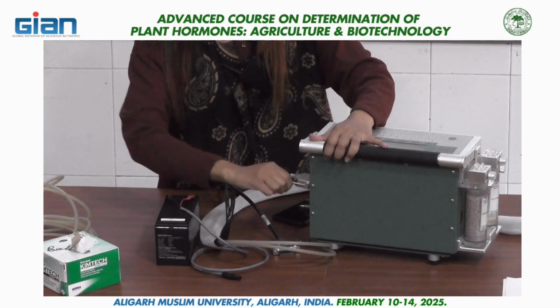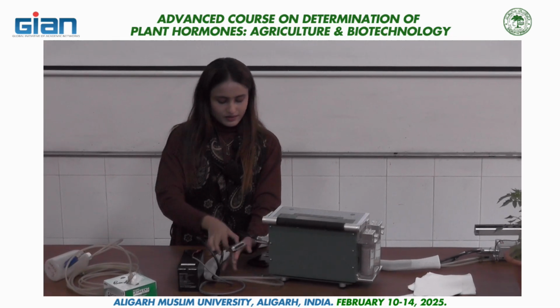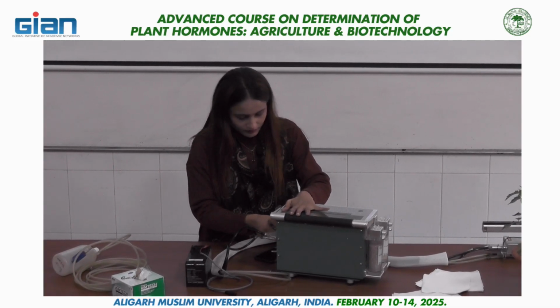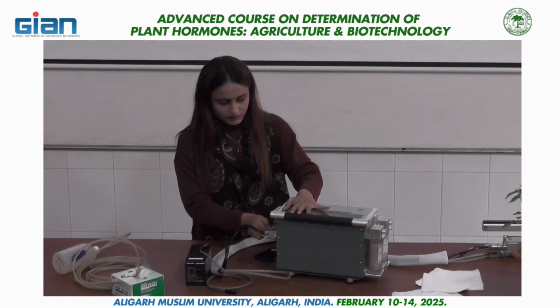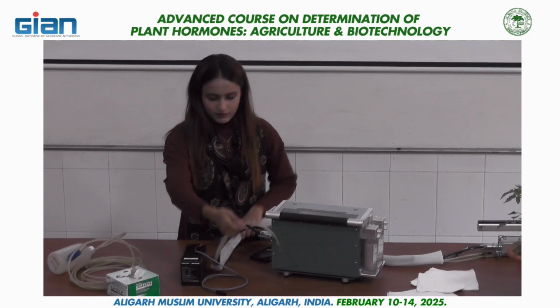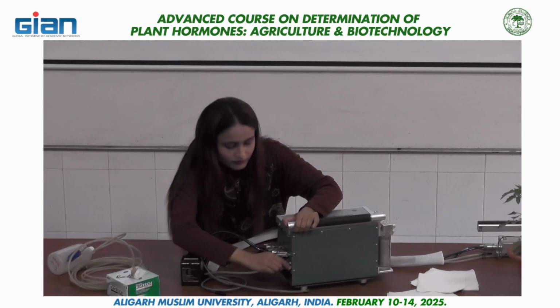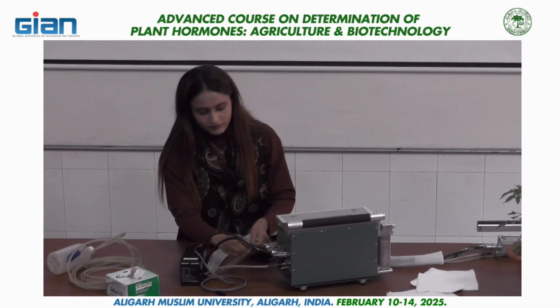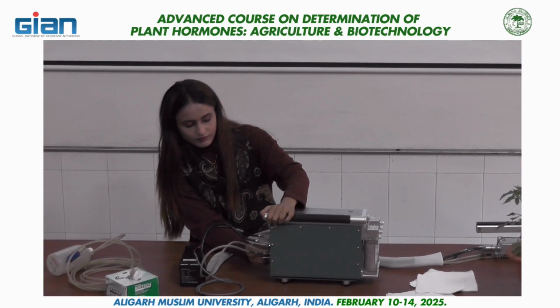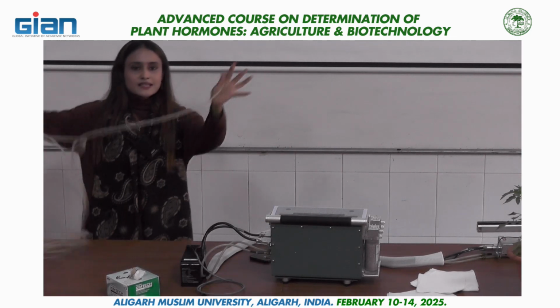Assembly of this IRGA is quite tough. Apart from this assembly, basically this helps in airflow.